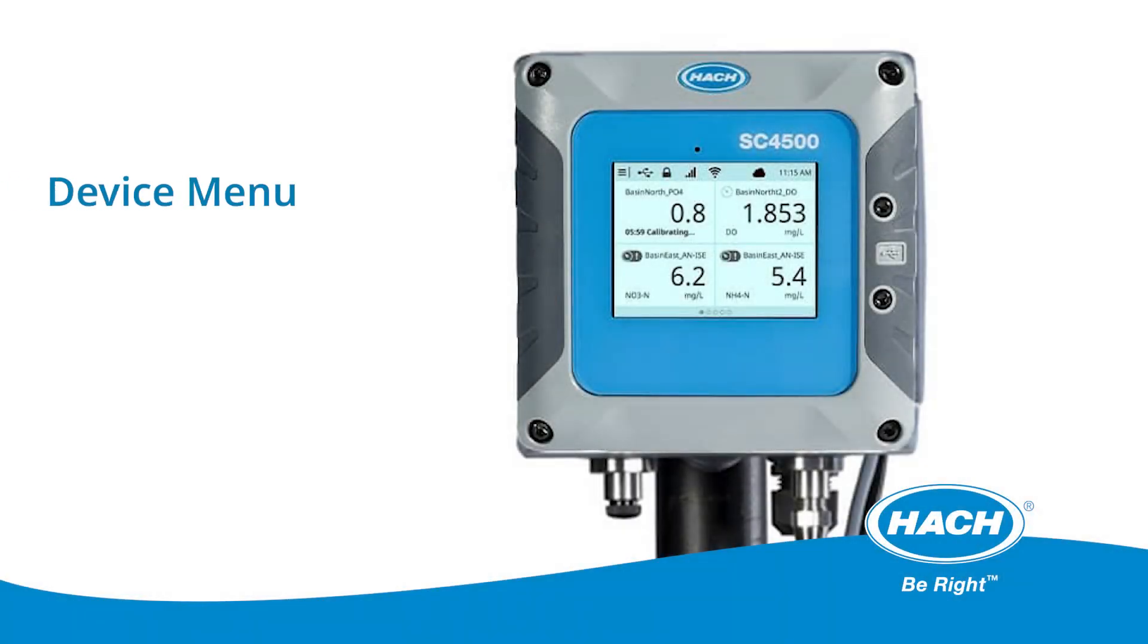Begin by entering the device menu on your controller. Select Guiding Task and then select Cleaning Colorimeter Cell.